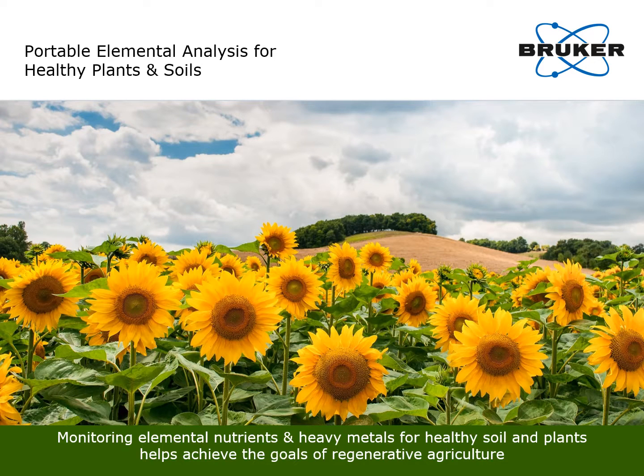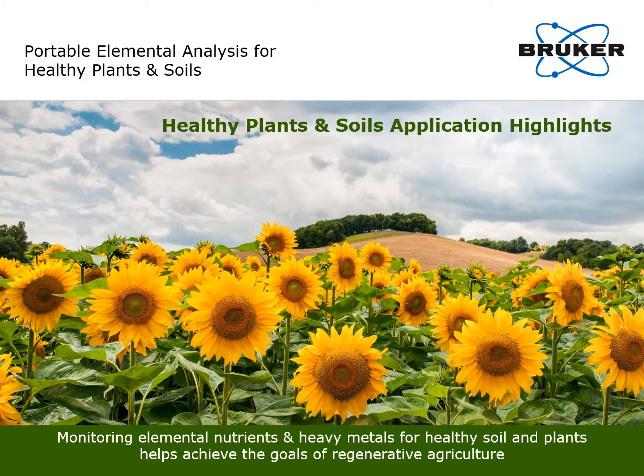It's important to know what elements are naturally present and which ones are introduced during the grow to make informed decisions for regenerative precision agriculture. Multiple scientists use portable XRF to do just that. The following slides highlight some of the applications from their work.